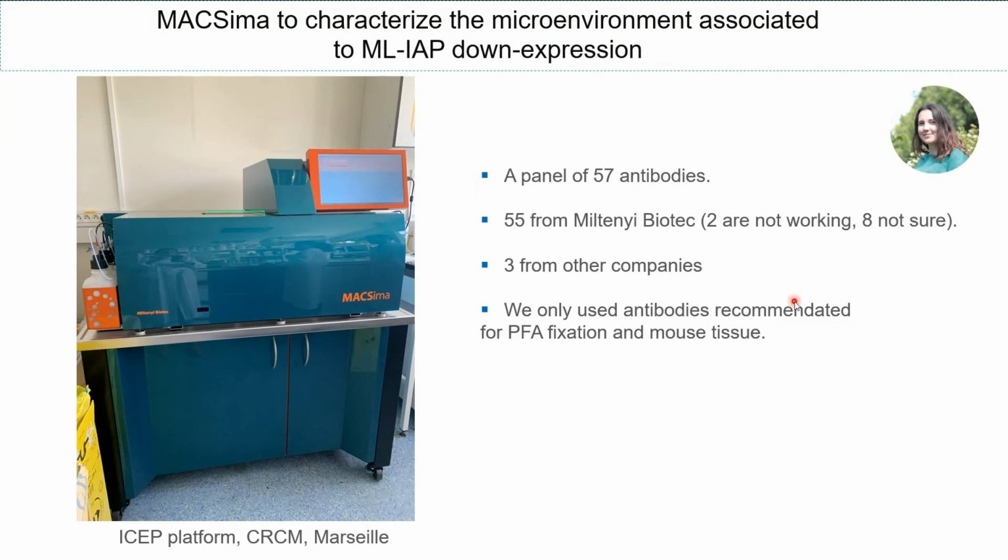to have a big picture, we started to perform MACSima, so spatial proteomics, and we set up a panel of 57 antibodies. We mainly used antibodies from Miltenyi Biotec. We used 3 other antibodies, and we used only conditions that are recommended by Miltenyi Biotec.